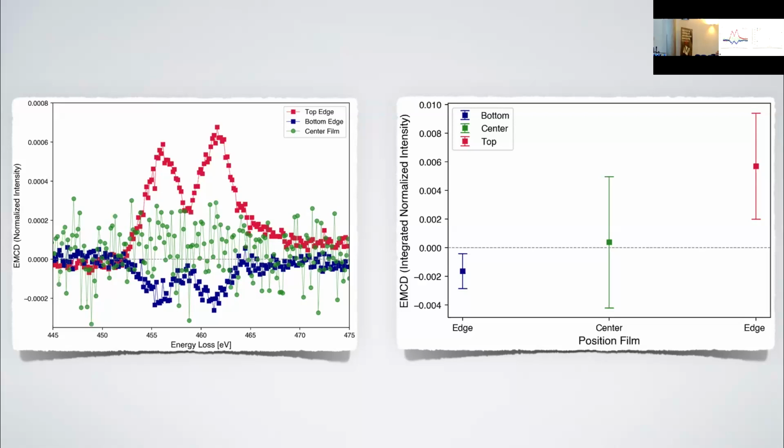Yeah, we thought about that too. You asked the question that I wanted to ask, but I have another one. Why is the intensity so different from one edge to the other? Excellent question. I think this is the first evidence of microstructure affecting the measurements. The grains are like 20 or 30 nanometers, so they will leak into current, and because the grains are different, the sample is slightly different at the top and the bottom, so we are seeing these effects.